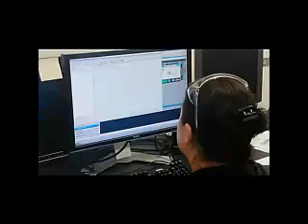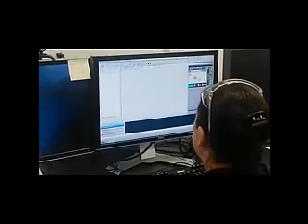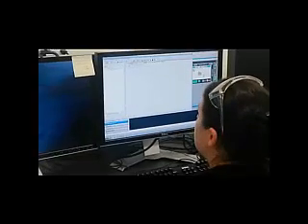Okay, now you can run it. Now do the clean. So click on it. Yeah, the clean. Click on where it says okay. Now do the same thing for the clean. Do it twice.